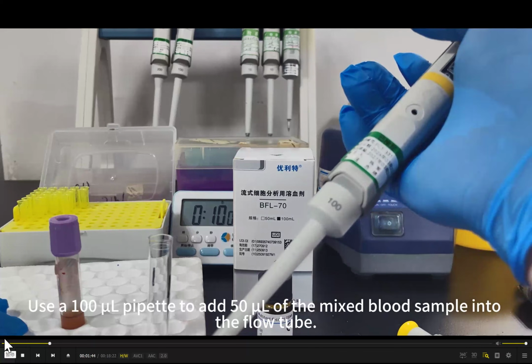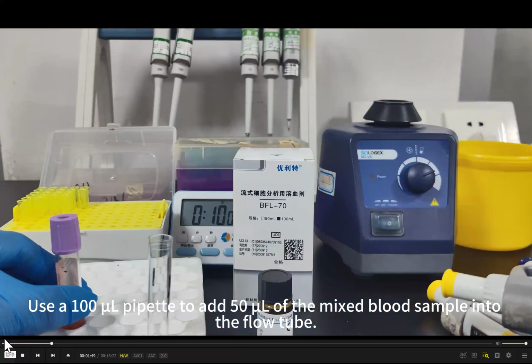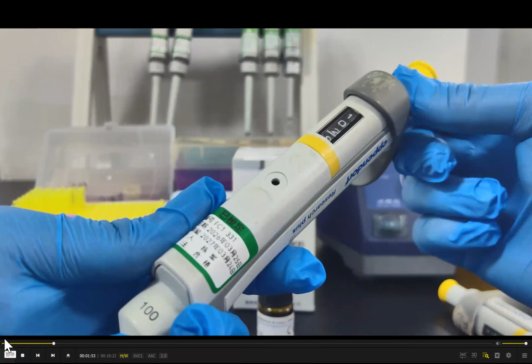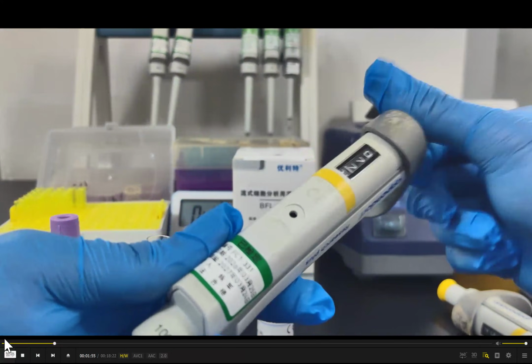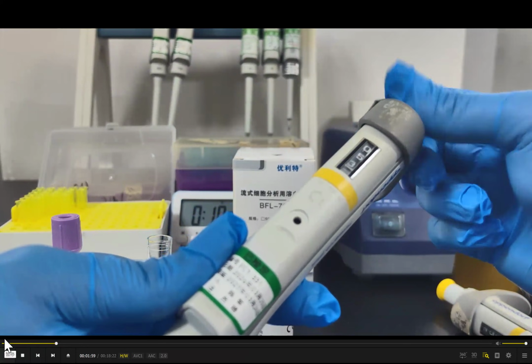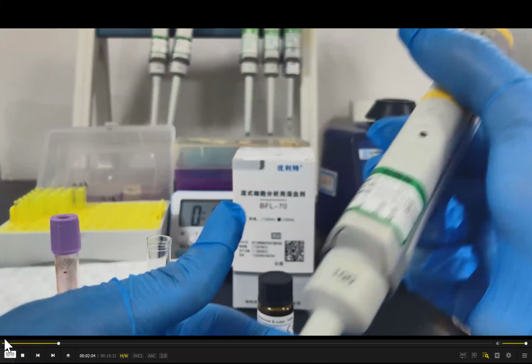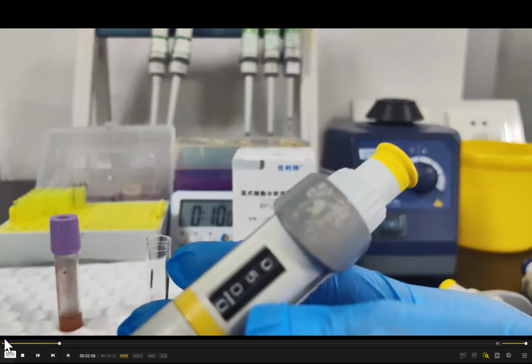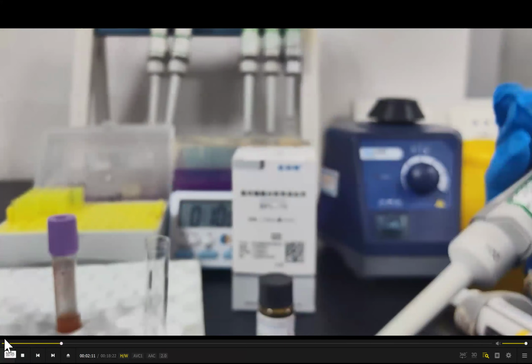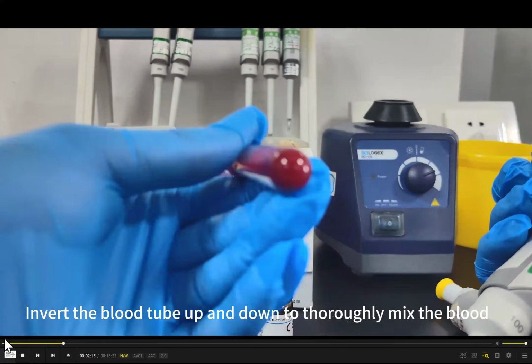Use a 100 microliter pipette to add 50 microliter of the mixed blood sample into the flow tube. Invert the blood tube up and down to thoroughly mix the blood.